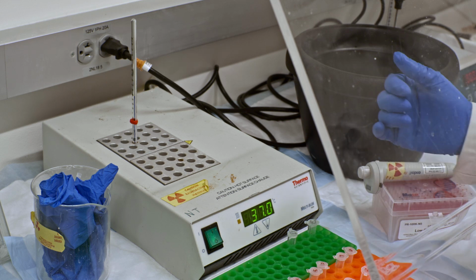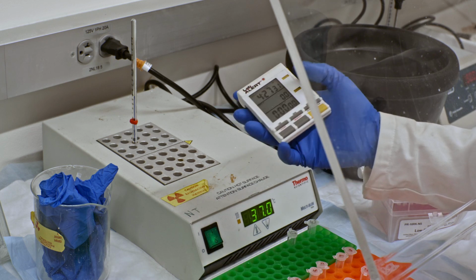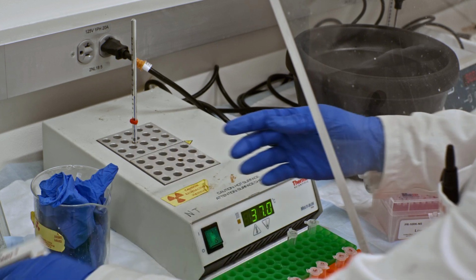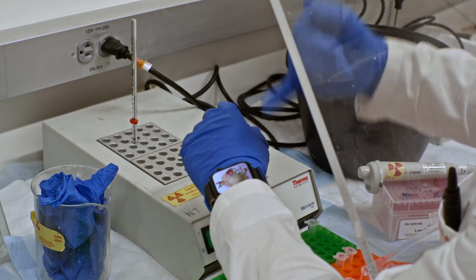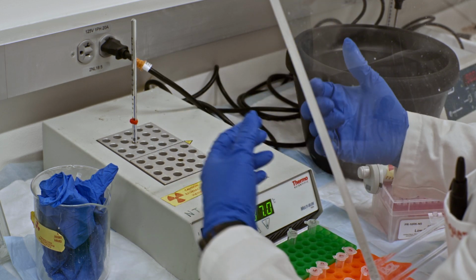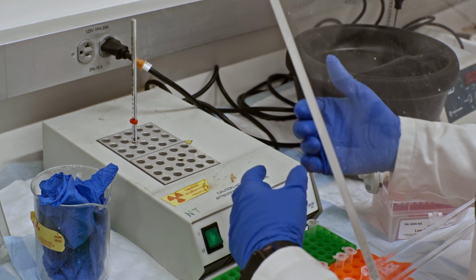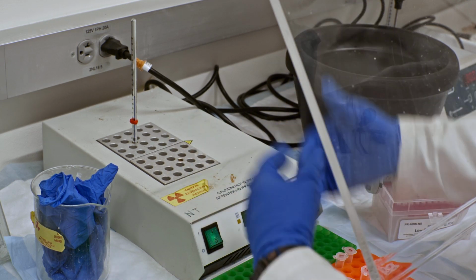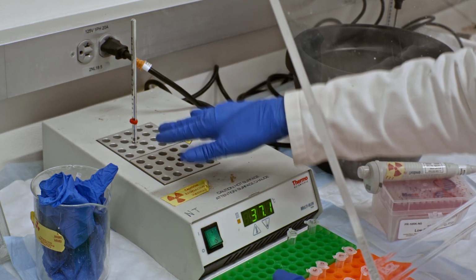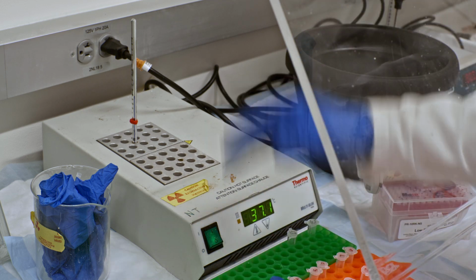Now this is where your choice of what you want to do for the timer comes in. We here in the lab have a timer that you can start as a stopwatch. If you have a watch on your wrist, you could always start a timer on your wrist. You just have to know your system. For me personally, I like having a watch on my wrist so I can look every few seconds at what particular time I'm at. And then once I know 30 seconds have passed, I can add my first additional dNTP into reaction vessel 1, incubate it, and another 30 seconds have passed, add more dNTPs, but this time to reaction vessel 2, incubate it, and so on and so forth.